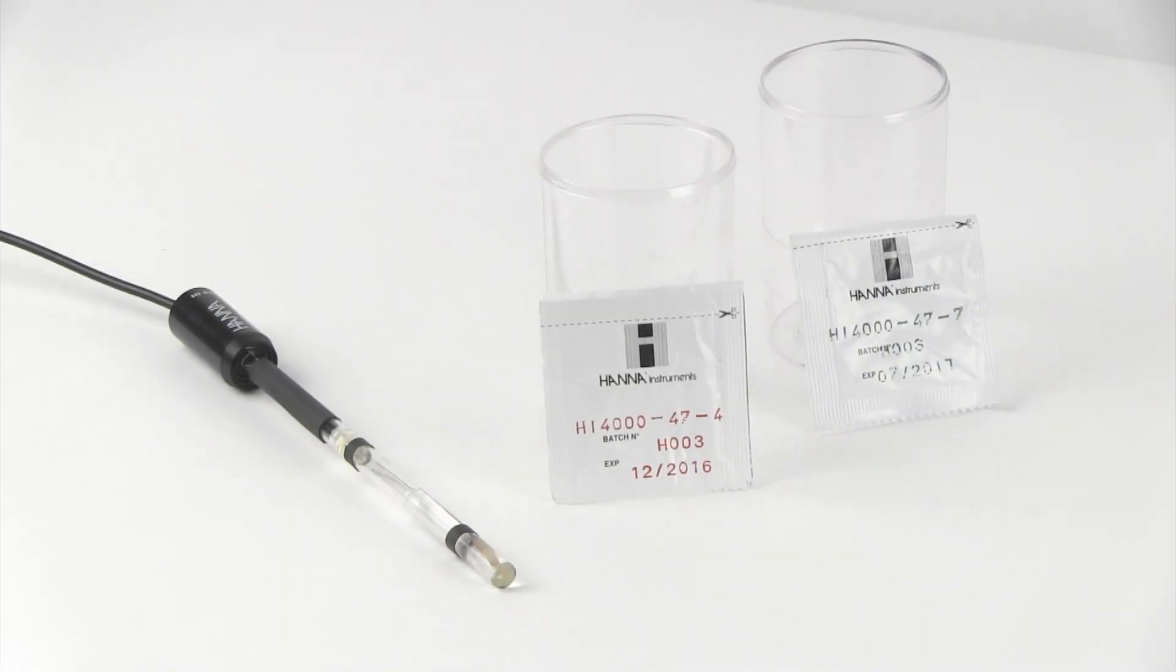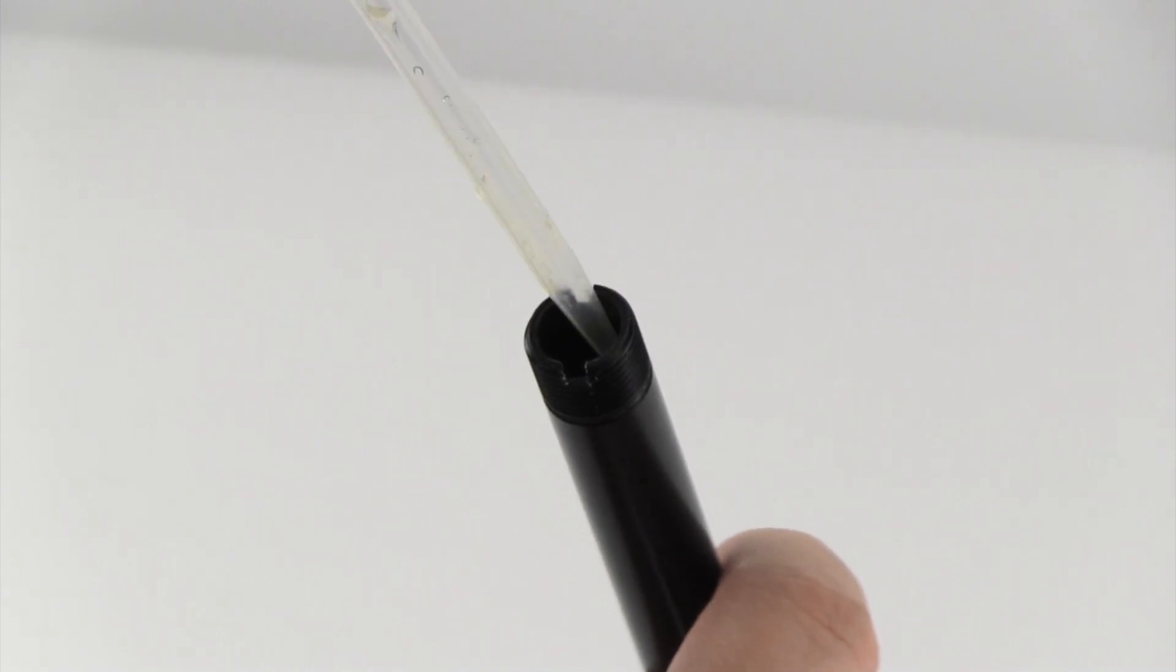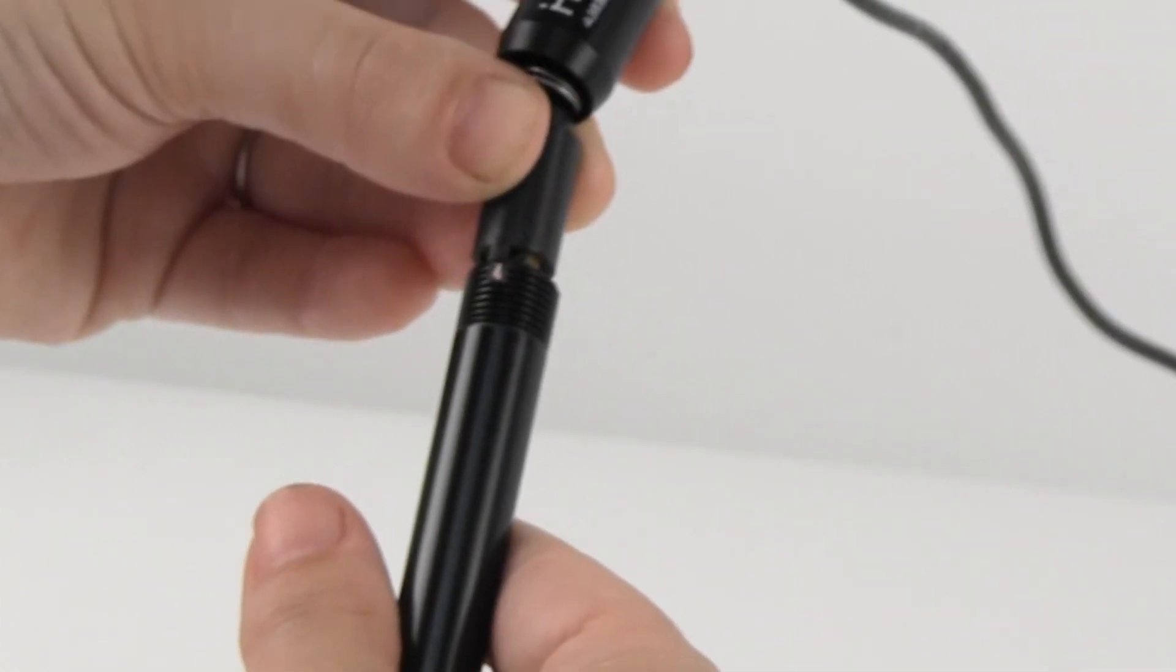Before reassembling the probe, you may want to perform a slope check on the inner pH sensor using the HI4000-47-7 and HI4000-47-4 buffer packets to ensure it is in good working condition. In the outer electrode chamber, add approximately 2 mL of HI4001-40 electrolyte.